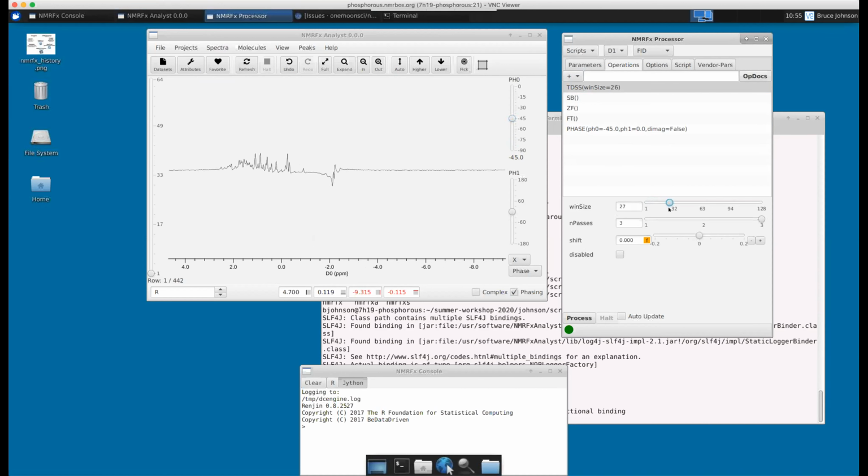So there's a limit, depending on how close your peaks are to the water, on how broad a region you can suppress. Fortunately, this doesn't have a peak too close to the water. The water is actually pretty bad in this spectrum, so it really is useful to get pretty small in the window size.